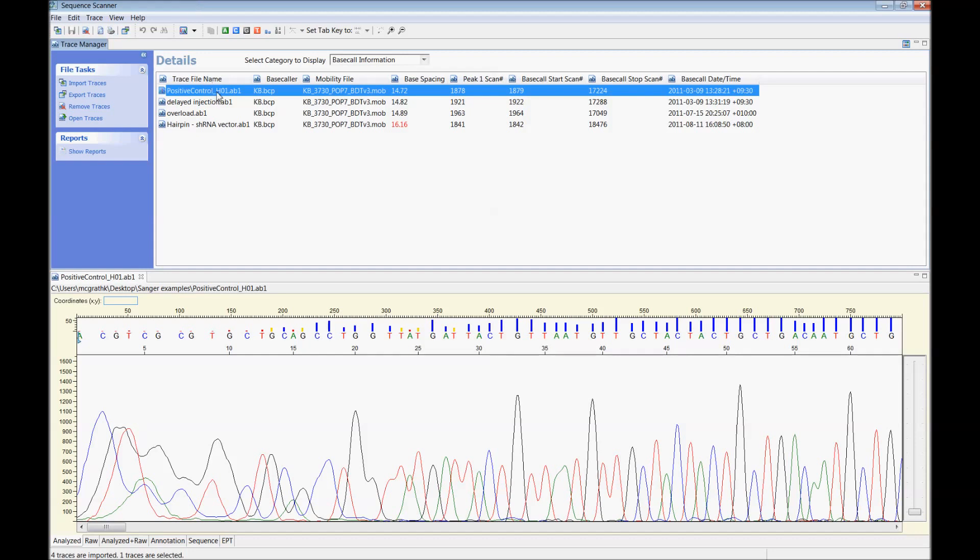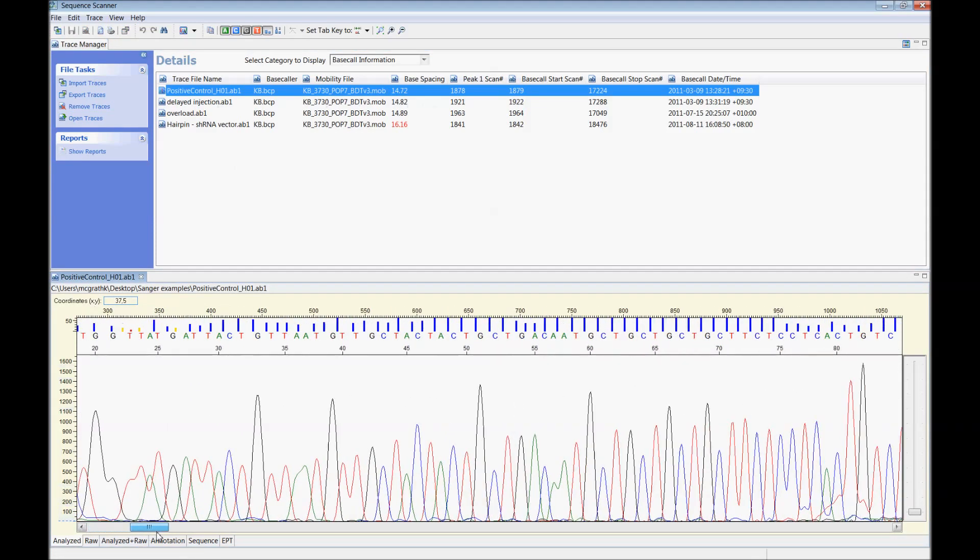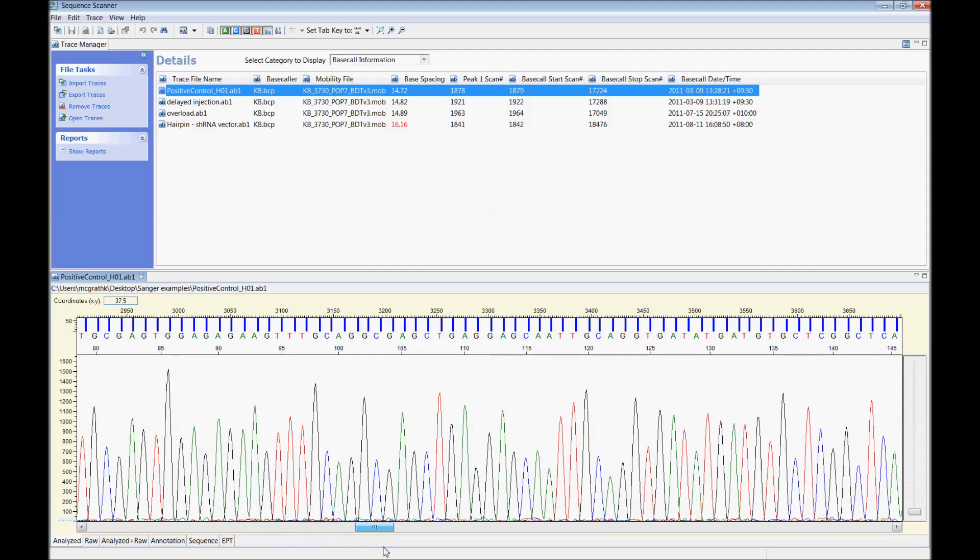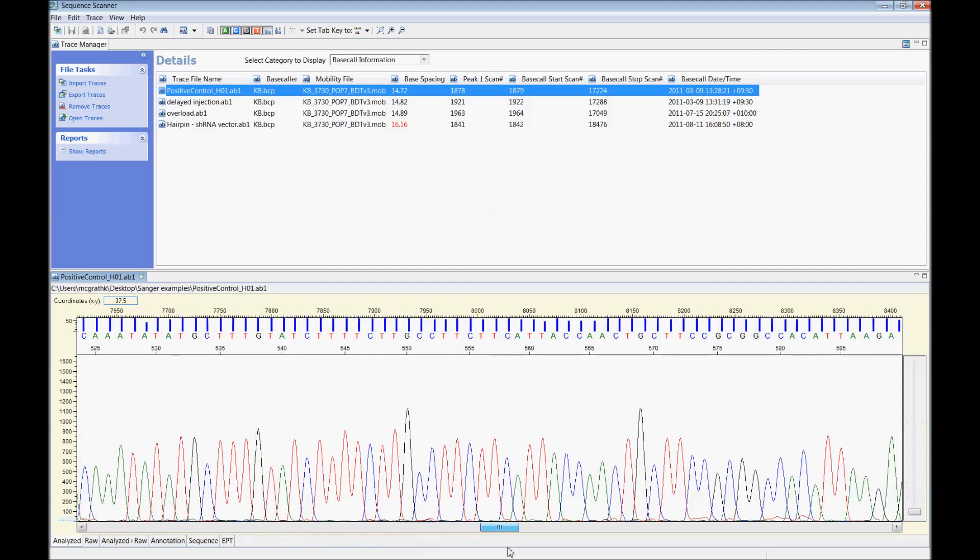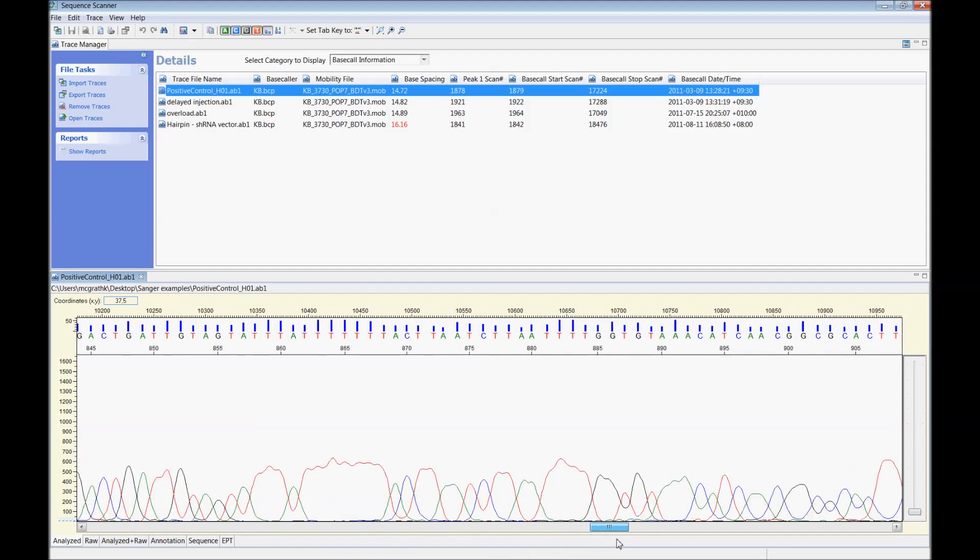So first we're going to open up an example of a good read. You can see the peaks are nice and clean and well separated. The clean read gets out well past 800 base pairs which is typical of a good run.